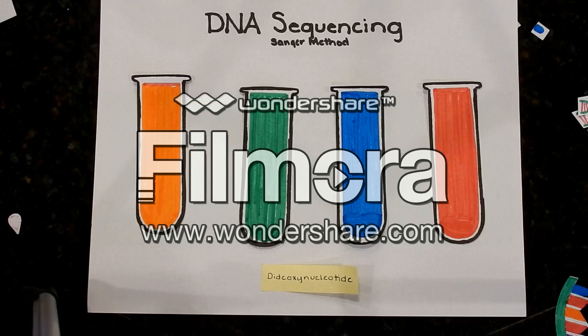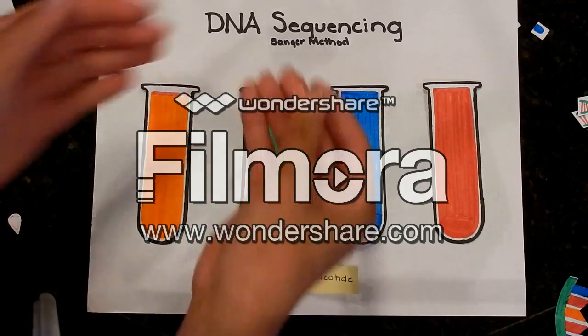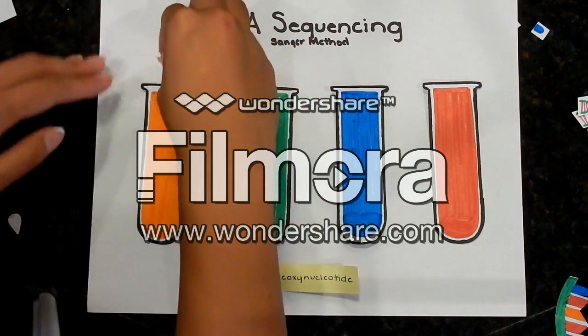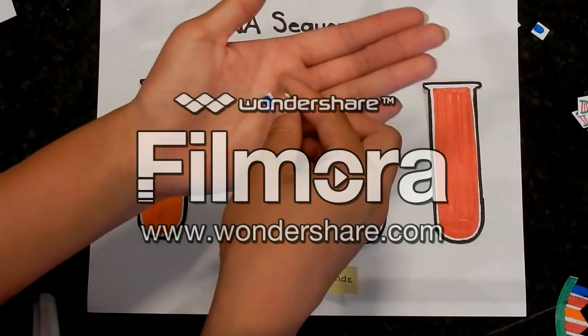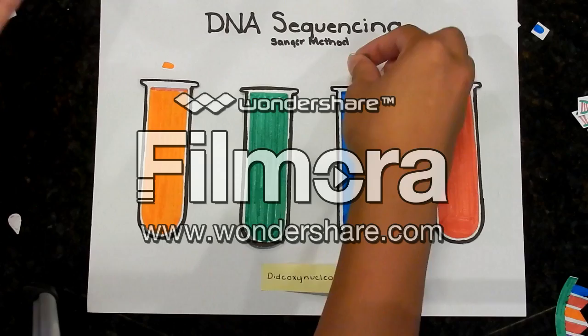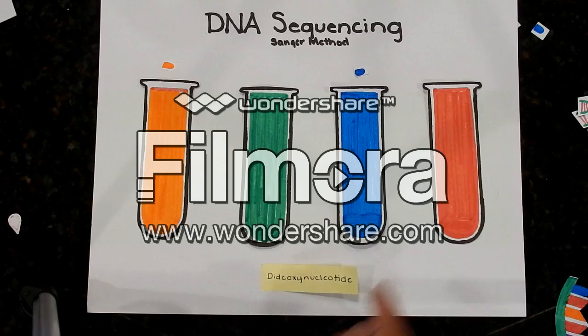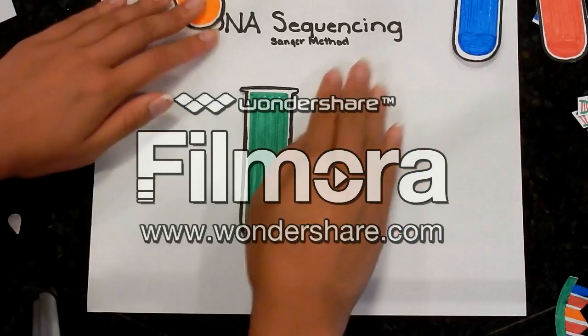However, you want to add one specific dideoxynucleotide to only one tube and not all of them. So, if this was a dideoxynucleotide that represented adenine, you'd only add adenine dideoxynucleotides to this tube. Then, if this dideoxynucleotide was cytosine, you'd only add cytosine dideoxynucleotides to this specific tube only. And the same goes for the next 2 test tubes.